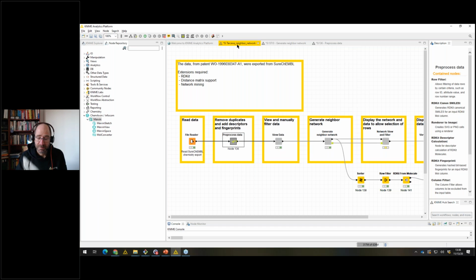There are some operations, however, that require the entire data set, and those will be a problem. There are also some operations that are n squared. For example, a distance matrix. The amount of time it takes to generate a distance matrix scales with the number of rows squared.